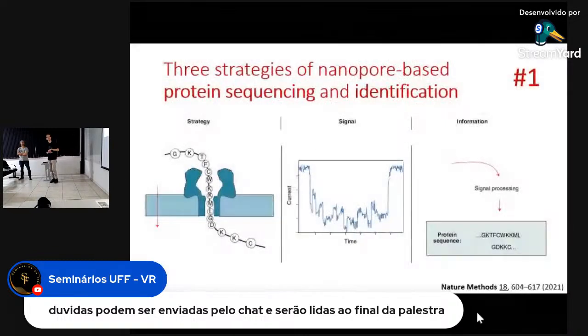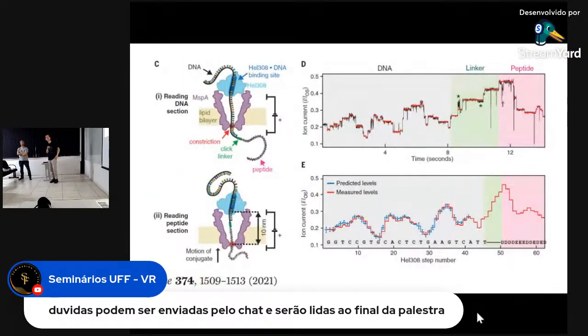So this last study that I was talking about is really experimental data, and at the lower bottom there's some predicted from MD simulations actually. I don't know whether they can really distinguish all 21 amino acids yet in this way, but at least with this approach, which is very similar to the approach that Oxford Nanopore Technologies is using, moving one base at a time, in this case one amino acid at a time. If it's long enough in the pore, you sample the ionic current long enough that you can distinguish apparently between these 21 levels. But I agree with you.